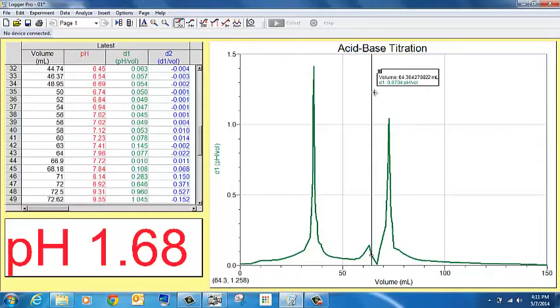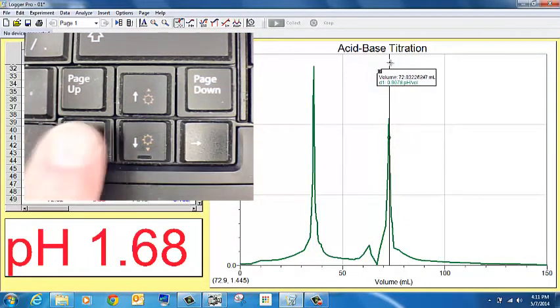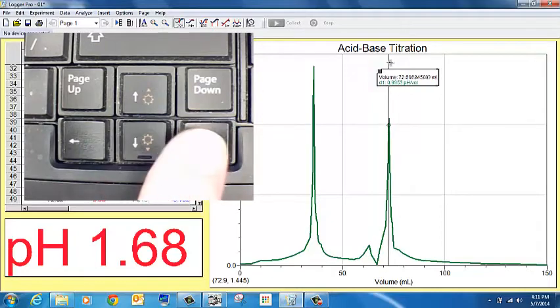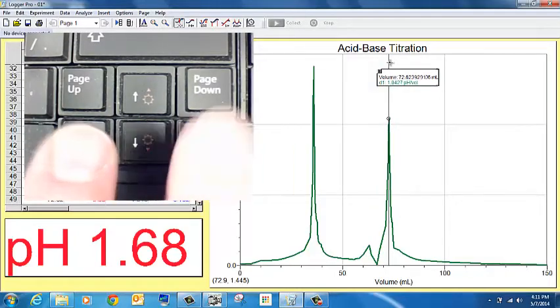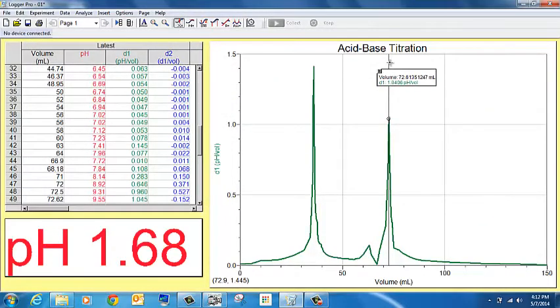Go back over here, and I can see this. This is where the second cliff face is located. And if I'm really careful about how I move this around, I can find that cliff, the point of the peak right there. And what I can do is, when I get close to that, I can use my right or left arrow on the computer keyboard to move it just a little bit at a time, like this, and find the exact peak. There's the peak right there. That tells me that the second inflection point and the second equivalence point is at 72.61 milliliters of the titrant, the KOH solution that was used.